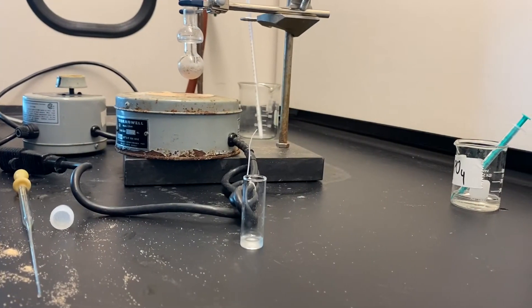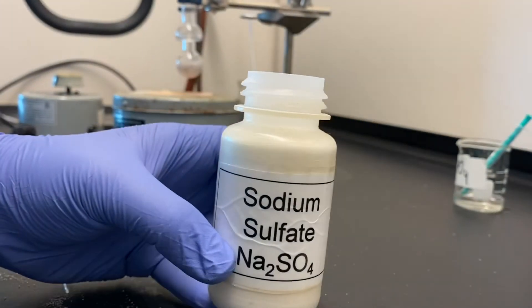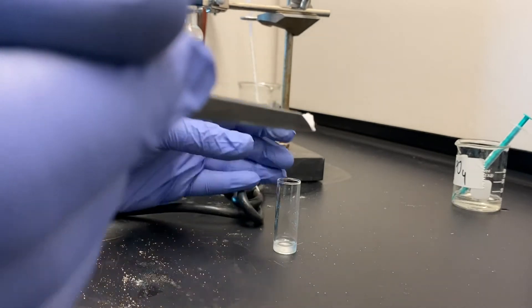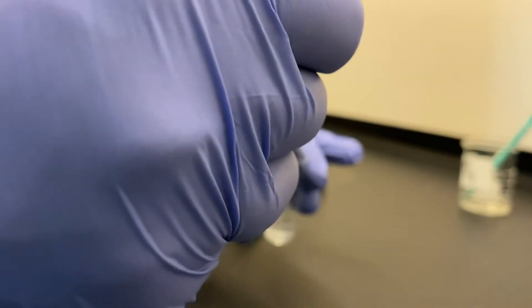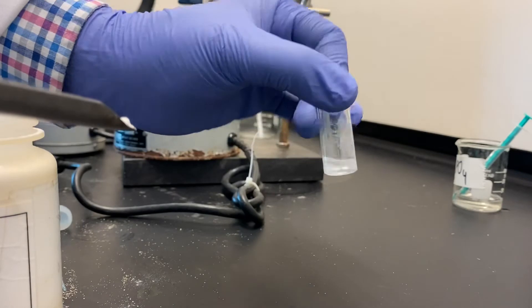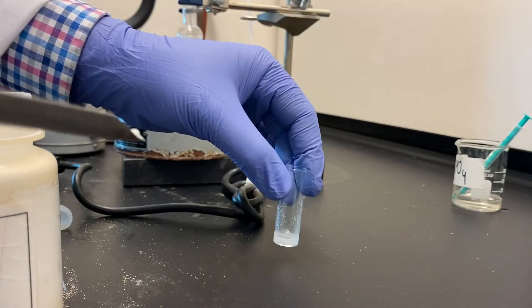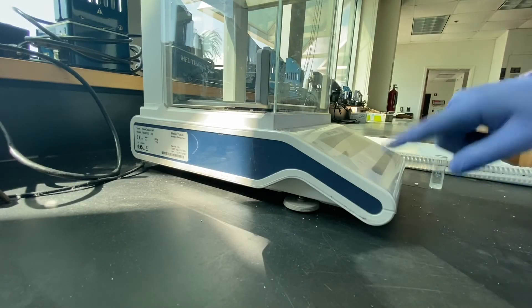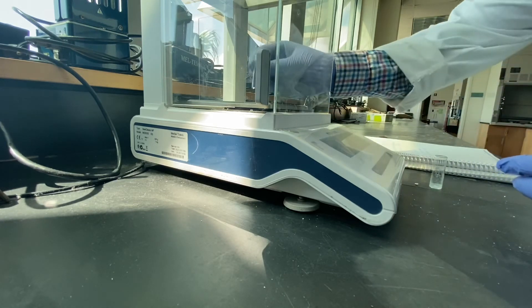If not, add a bit of sodium sulphate to this vial to absorb the remaining water. Let the liquid sit on sodium sulphate for at least five minutes. Meanwhile, weigh a shell vial and record its weight in your notebook.